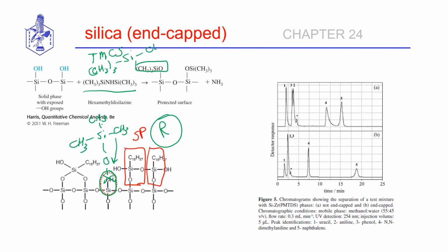silica column. And to show how that can be very useful, to the right here are 2 chromatograms. The first was done on a non-end capped column. We are separating basic pharmaceuticals. So amine groups tend to get caught up on the unreacted silanol sites, and you can see that we have a fair amount of peak tailing happening for some of these peaks, and we got a lot of overlap on this one over here.